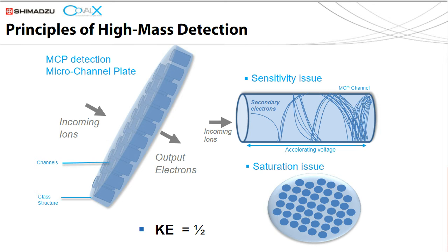They're going to cascade through, discharging that tube of the MCP, therefore making it turned off for the rest of that time-of-flight experiment. It will charge back up for later laser shots, but on that time-of-flight experiment, it will be discharged, making the detector less sensitive due to this saturation effect.